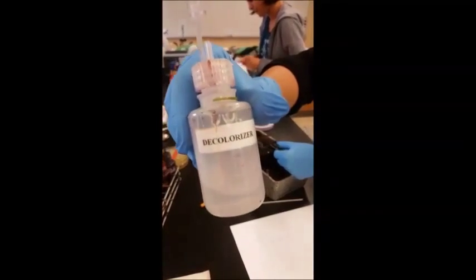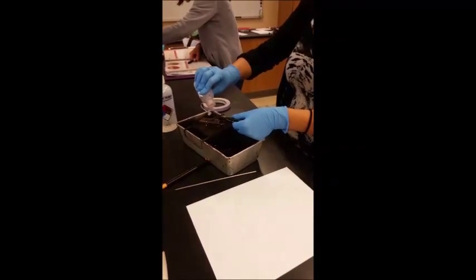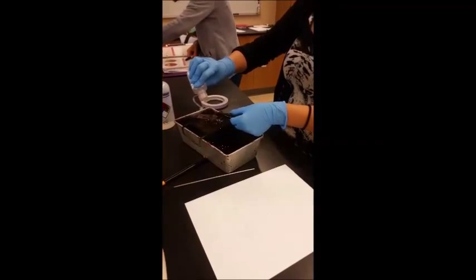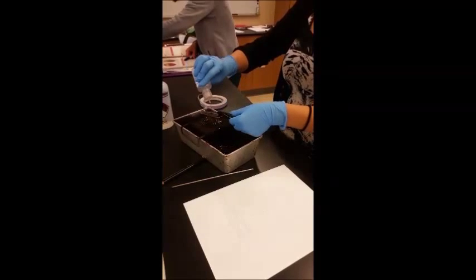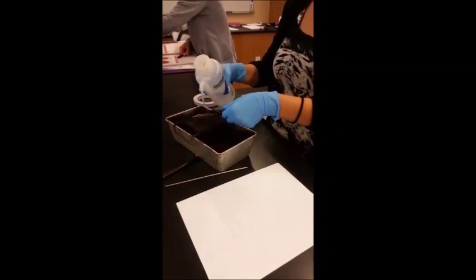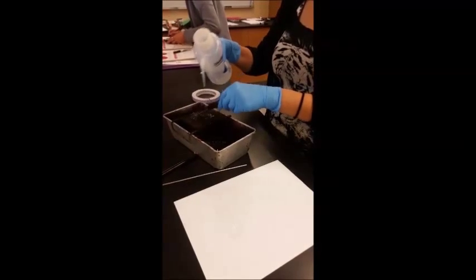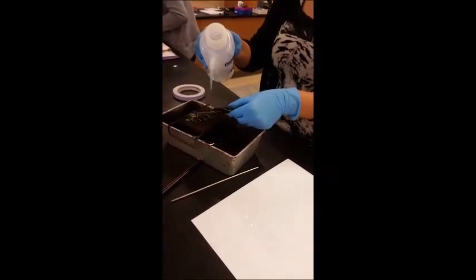And then we add the decolorizer just for 10 seconds, not more than that, because it will wash off the dye. Just 10 seconds. And after that, we will rinse it with water. Try to do it from both sides. Clearly.